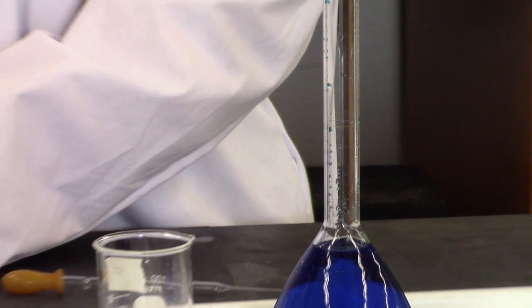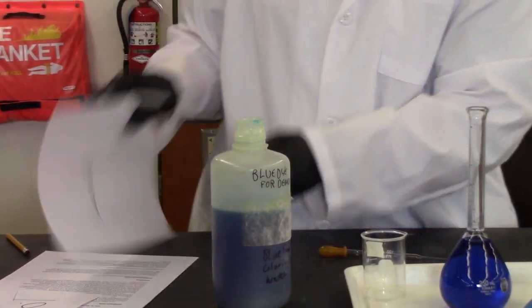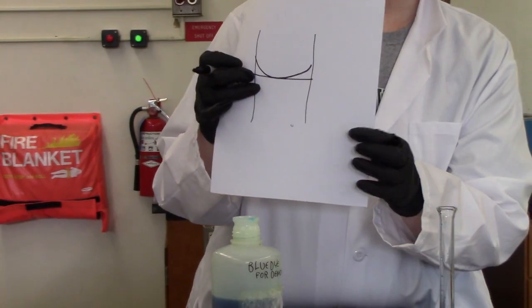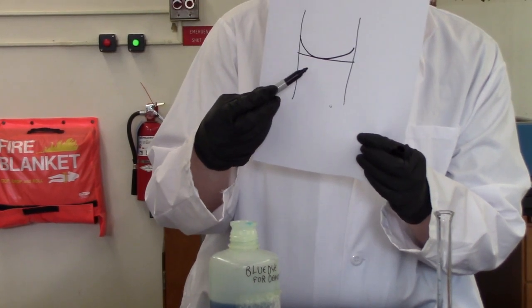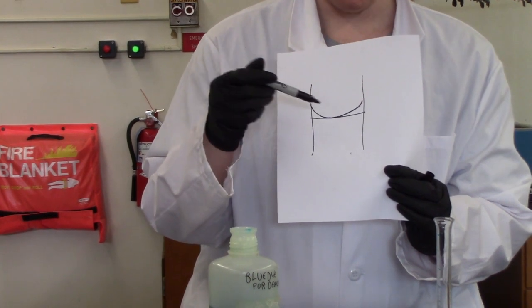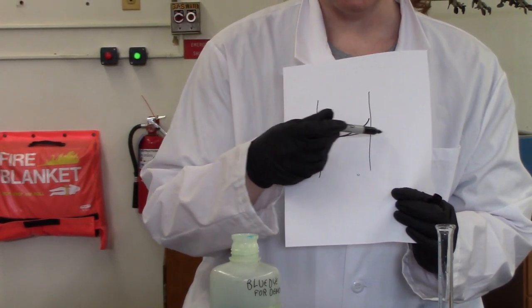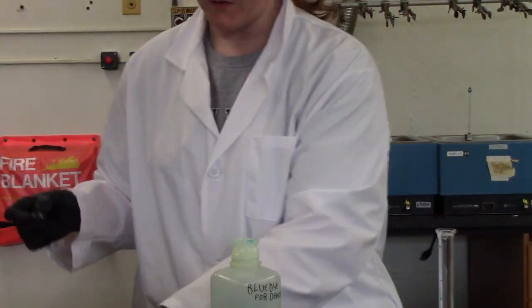And what I want is to have the meniscus just like this, all right? So our etched line, if we're looking at it at eye level, is going to be a line instead of a circle. So that's one clue. And then what I want is the bottom of the meniscus. Your meniscus will be symmetric, right? Mine's not, but it will be when you do it for real. The bottom of the meniscus is going to touch that line just perfectly. So to achieve that, we are going to use pipettes.